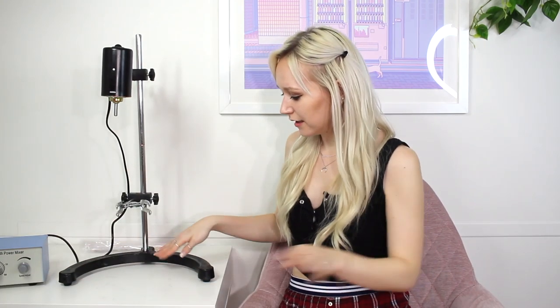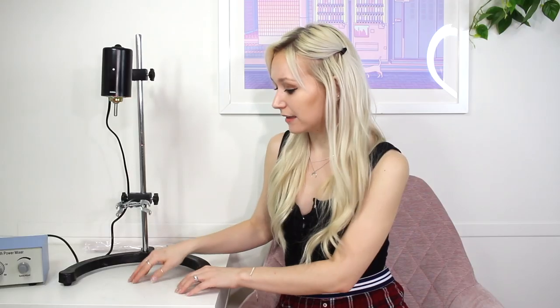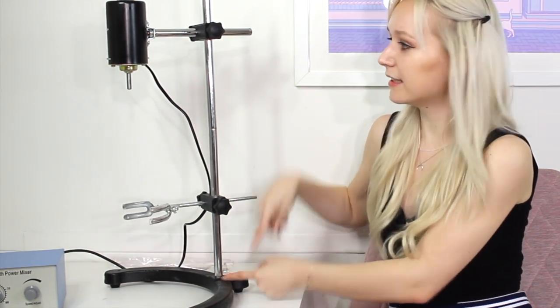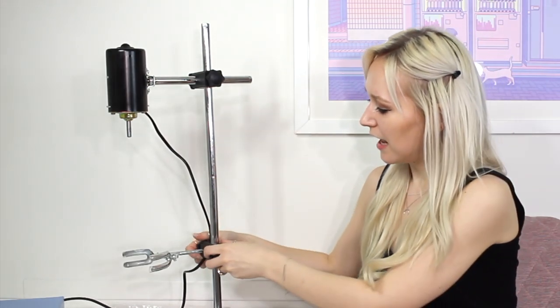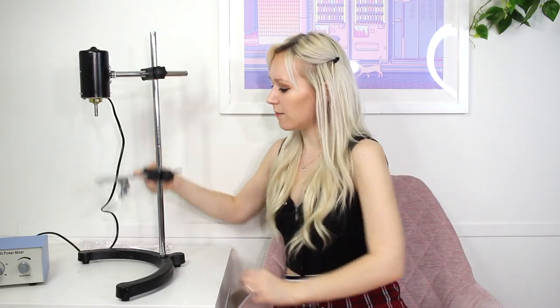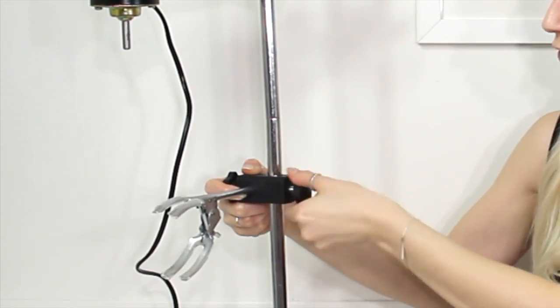An issue with this machine is that it makes black scuff marks all over my surface, which is kind of annoying because most of my surfaces are white — but it washes off with some rubbing alcohol. Here is the base. This base is super heavy; it feels like cast iron, which is a good, nice, heavy base to make sure it holds everything in place. There are two bars: the first bar screws into the base, the second bar screws into the first bar, and the black things just slide through the top and are adjustable with a little screw.